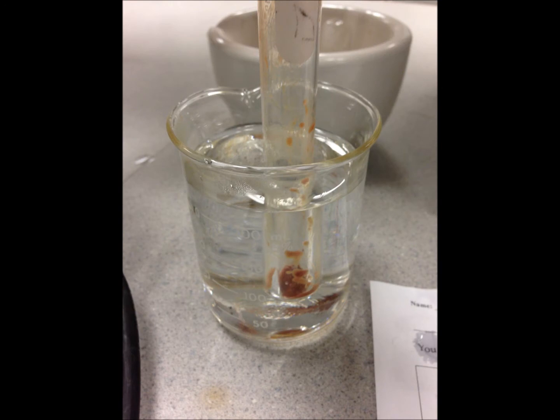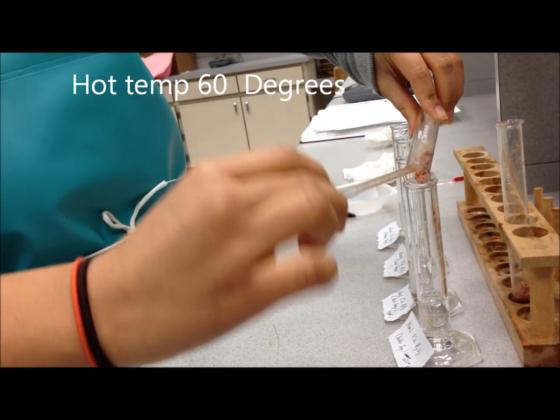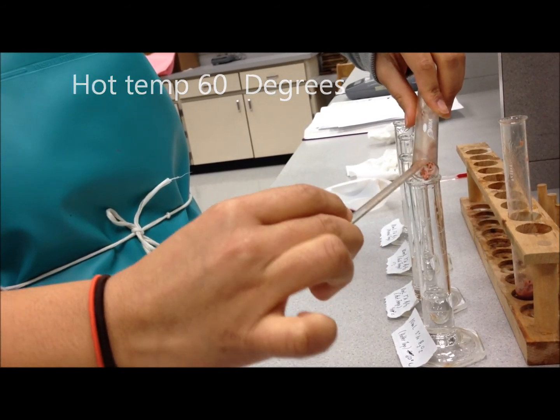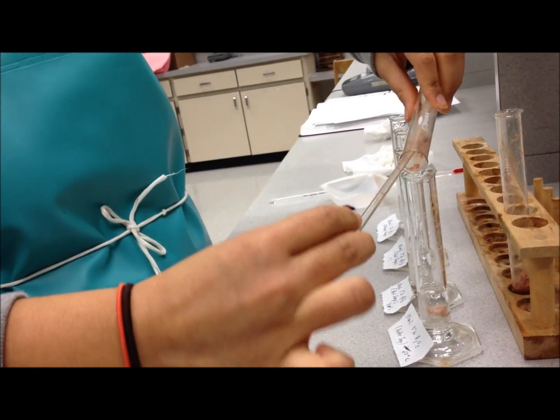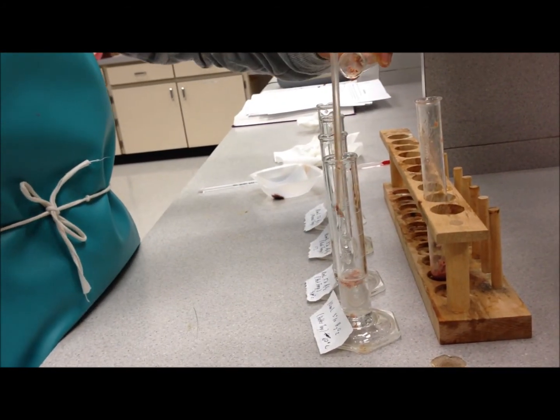Then we placed the liver from the hot test tube into the first cylinder containing the 10 milliliters of 3% H2O2. We did the same thing with the second test tube, except we waited until the temperature turned 60 degrees.